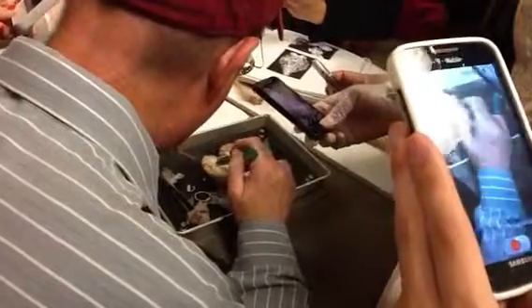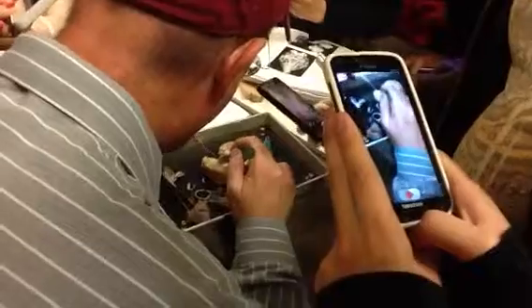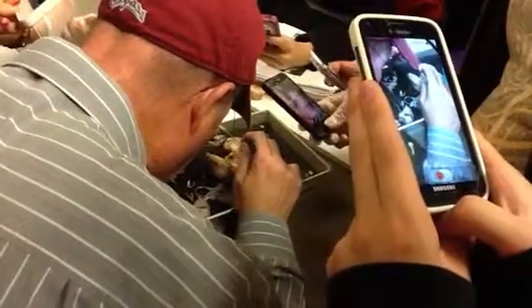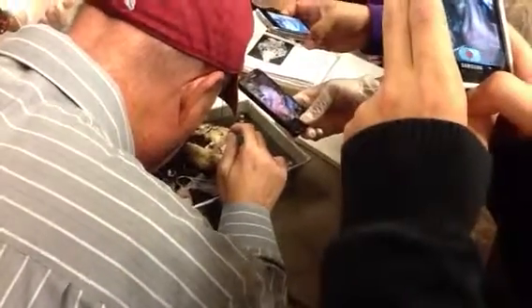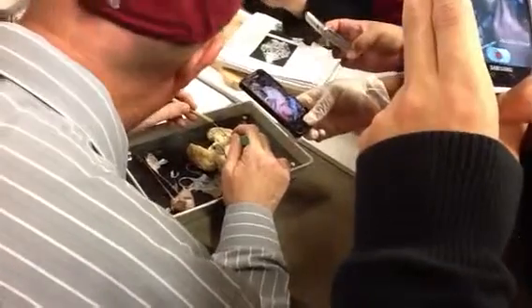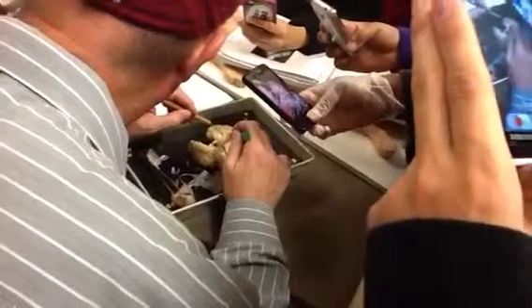Lateral ventricles you can separate in here. See, there's a lateral ventricle right there. See that? Lateral ventricle. So you'd have to open up the brain to see that, it's a little bit deep inside. Or I could just put something in there and show you the ventricle.